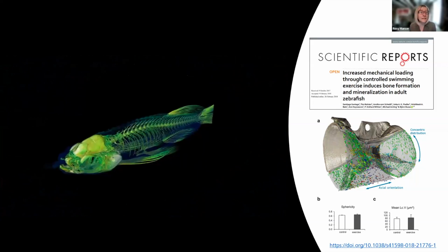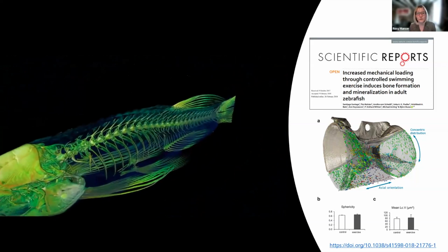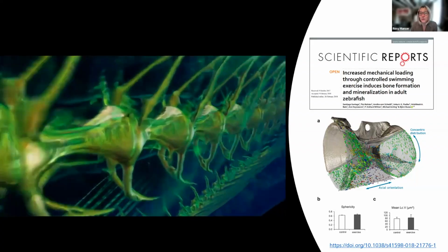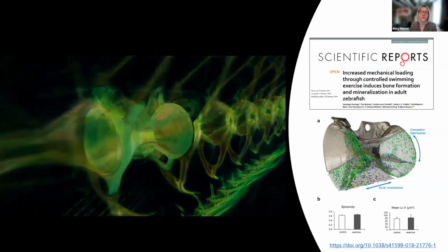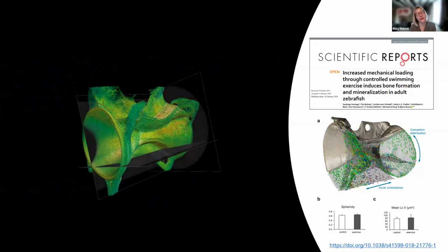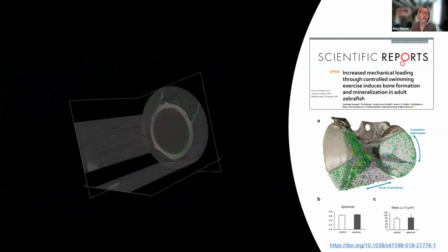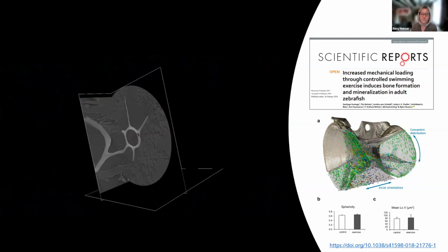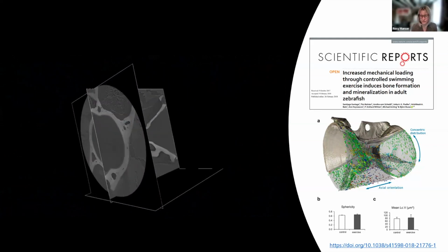But the really cool thing about the X-ray microscope, when you get to those higher resolutions, is that they didn't just look at distribution, you know, where they are, they could also look at orientation of those osteocyte lacunae. So the higher level, high resolution information gave them access to more data points and more comparative ways of being able to look at the fish relative to each other.